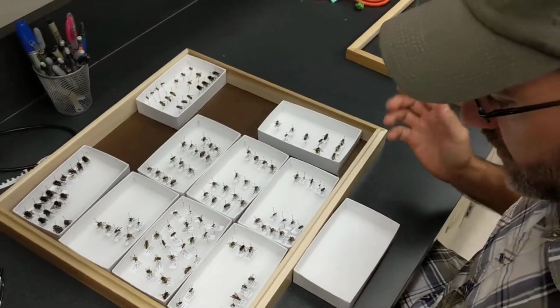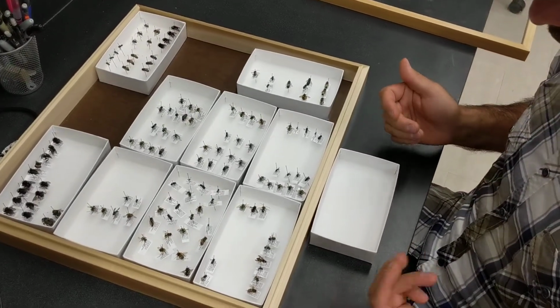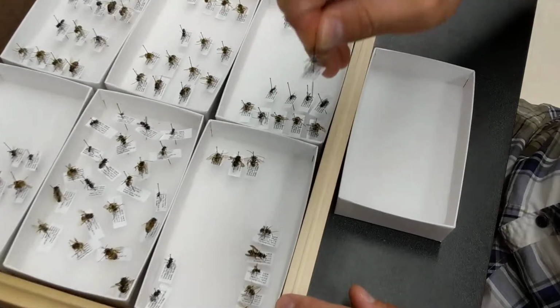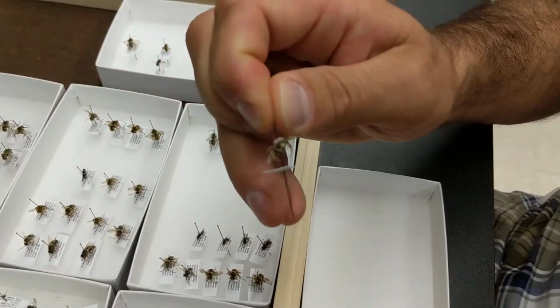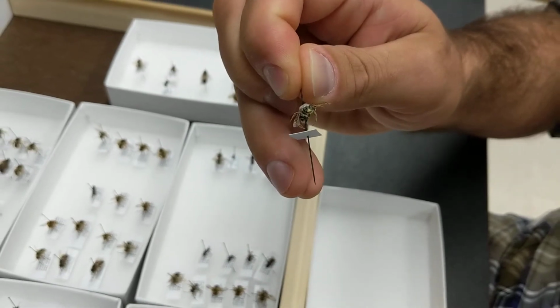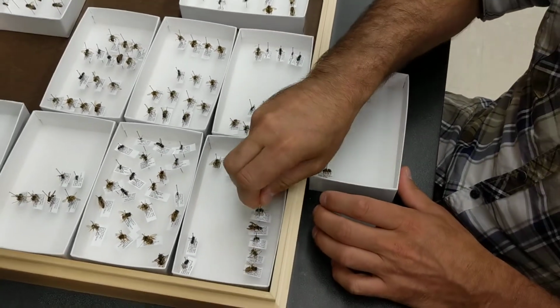So what are we going to do next? Well, an obvious choice, just looking at these trays, is to pull out all of these bees that have ridiculously long antennae, because that's easy to see. And so we'll do that. We'll pull out all of these bees with ridiculously long antennae.